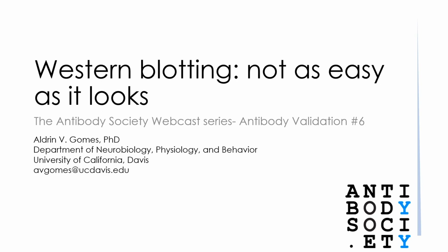Yes, that's a very important aspect. But the good news is that software is continuously being upgraded. Many of the software we use, every year they update and they get better and better. Five years ago, the software was nowhere near as good as the software we have now. So the software now can really detect saturation very easily, and it shows you. You have to turn it off manually, actually, from many of the new software.